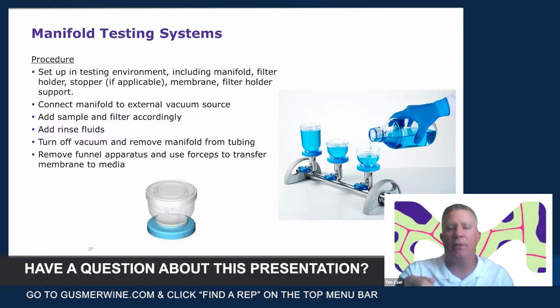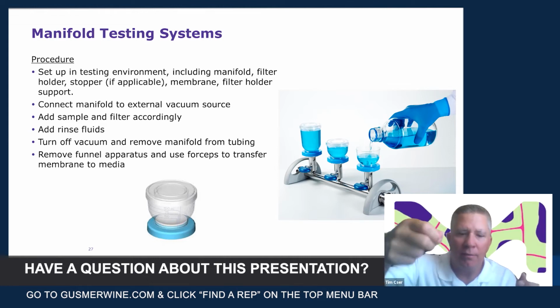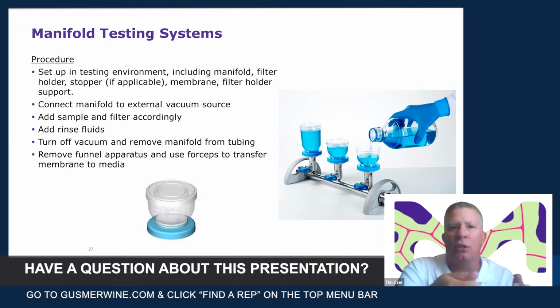And that's where you really want to have your aseptic technique. You want to use your forceps when you pull the filter cup off. You want to use your forceps very close to the edge and not touch the actual filter. I know a lot of people flame the forceps, but good aseptic technique is something to pay attention to, so that you're not introducing any external contamination that wasn't in the sample.